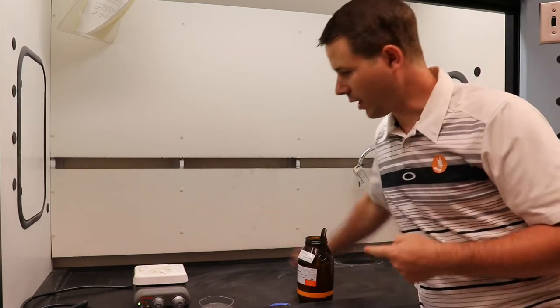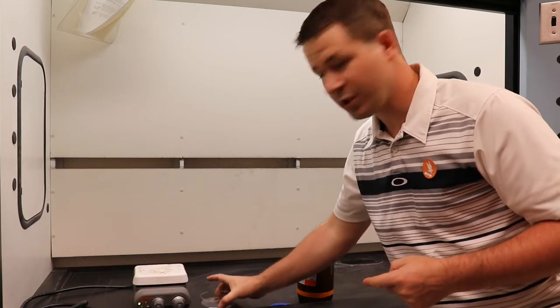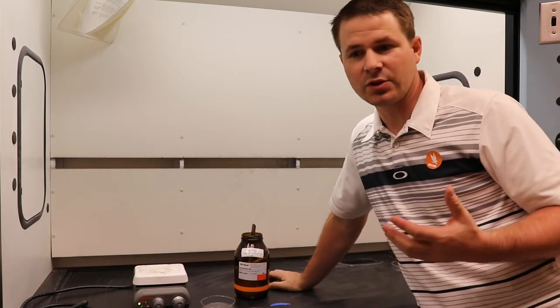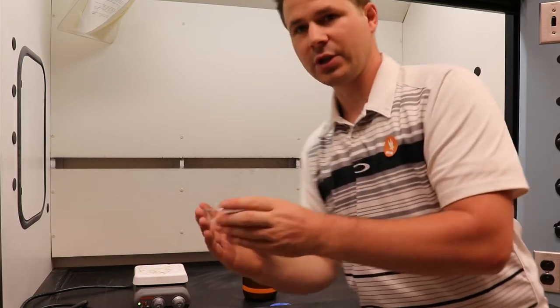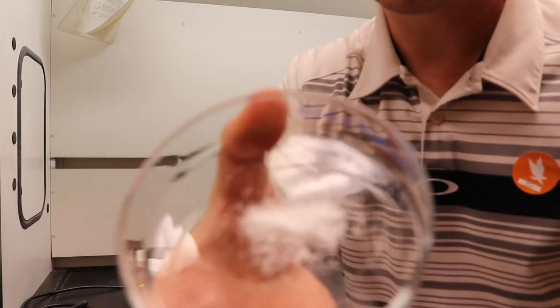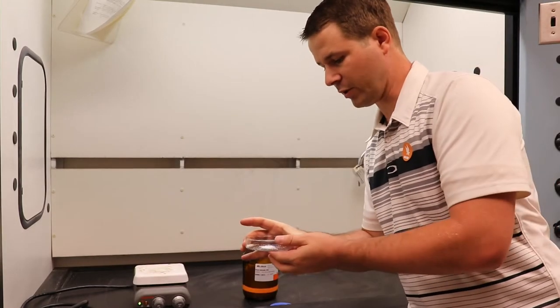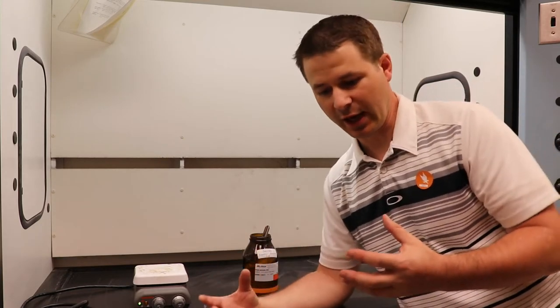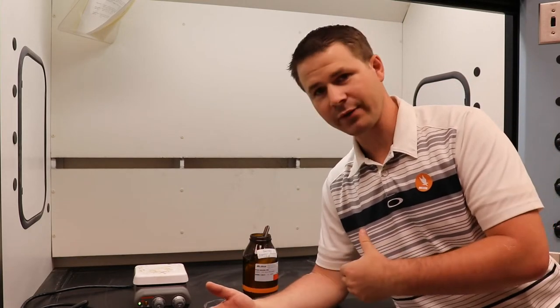So I've got this set up here. I've got a hot plate, petri dish, and phenyl salicylate, which is a solid crystal. You can see it looks a lot like sugar, but it has a very low melting point. So we're gonna put that on the hot plate, let it melt, we're gonna get a bunch of it in there, and once it's completely melted, we're gonna take it off the hot plate.